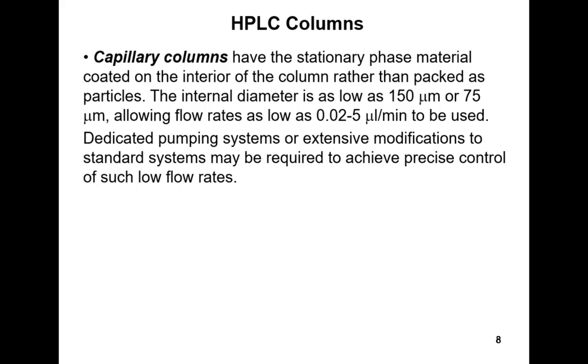But this requires specific pumps to be able to control those low flow rates precisely and give you reproducible results. And it's going to affect the detectors as well, because of the much lower volumes that are going through into the detectors.